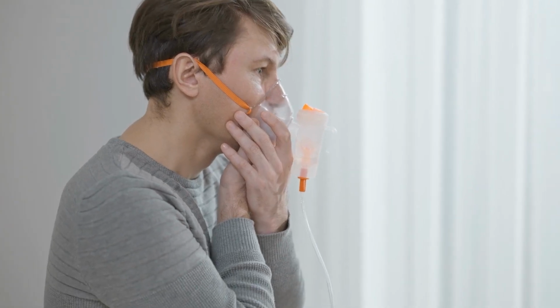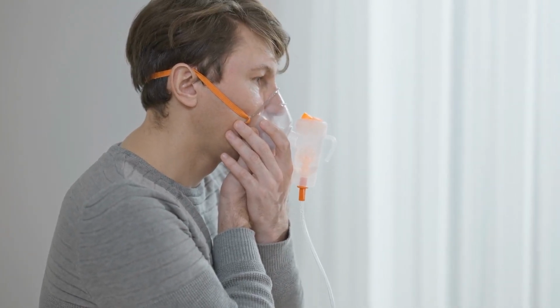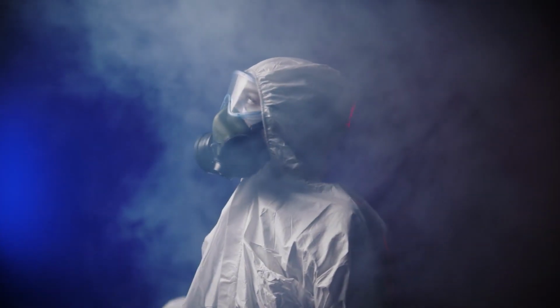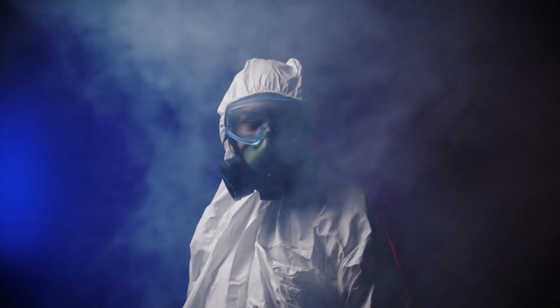Toxic gases are those, like chlorine, that present a serious problem when inhaled or in contact with the skin or eyes. Exposure to these gases shouldn't exceed OSHA limits, as these gases could lead to chemical poisoning and the symptoms may not show up immediately.